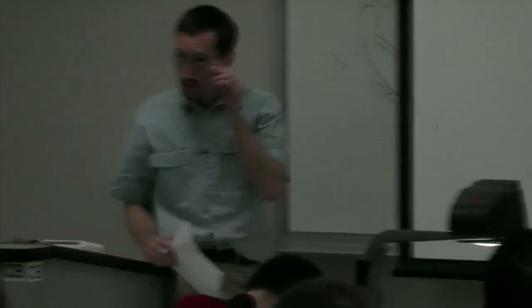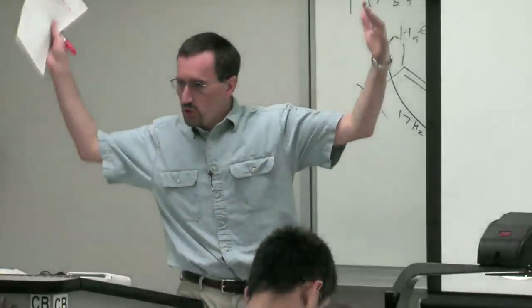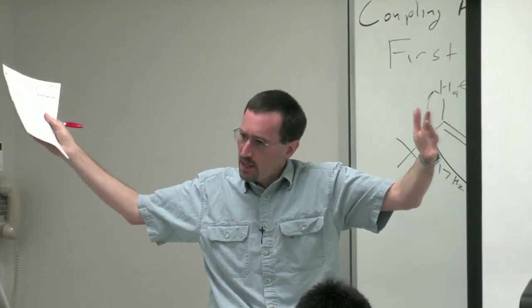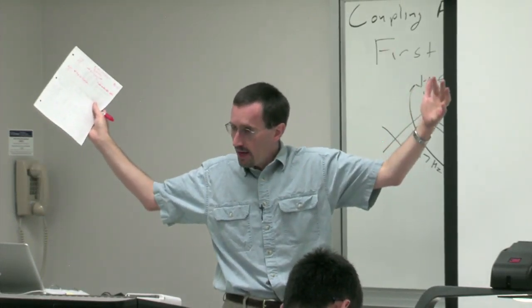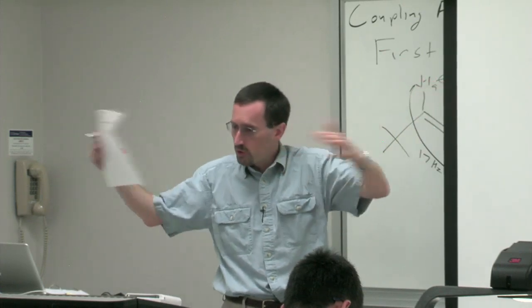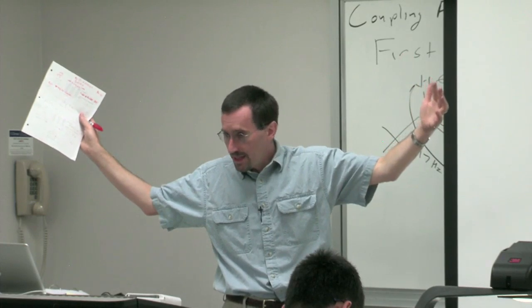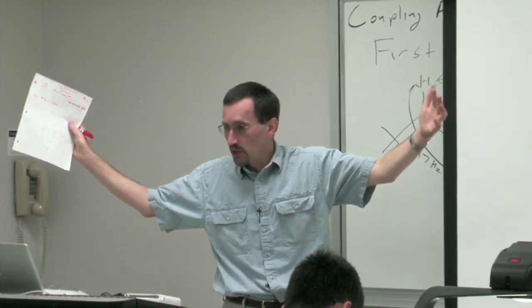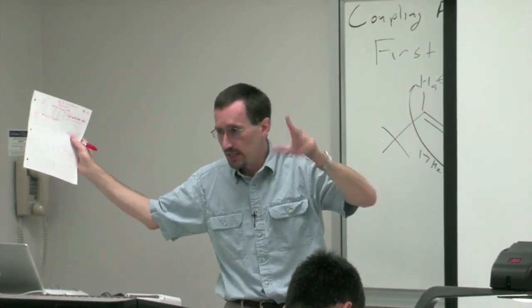That's the maximum resolution of the instrument. And in carbon NMR, where your sweep width is now about 20 times as large, typically your digital resolution is on the order of 1 hertz, because you might have 32,000 data points, but your sweep width now might be, for example, 20,000 hertz. And so your digital resolution is about 1 hertz. So typically people report J's in the carbon to just the nearest hertz.